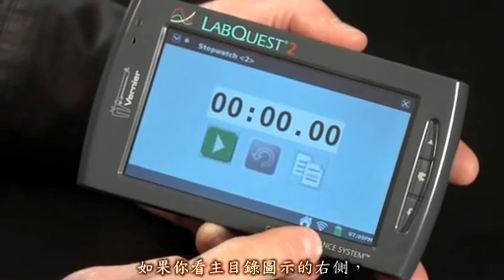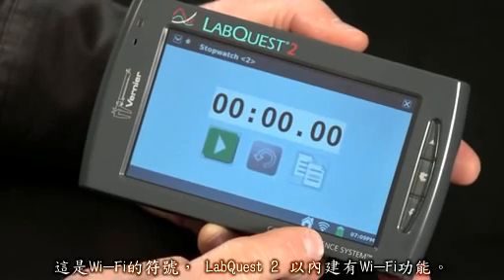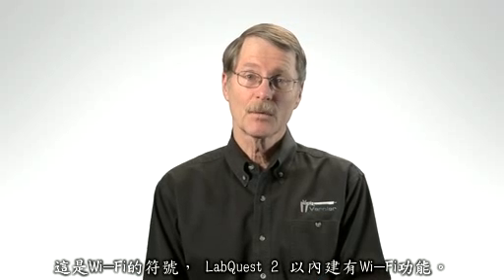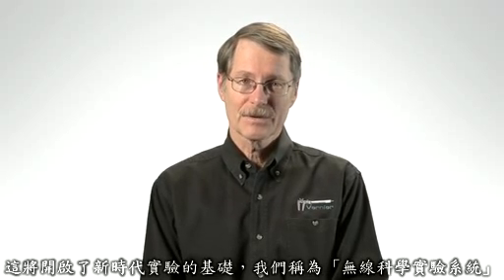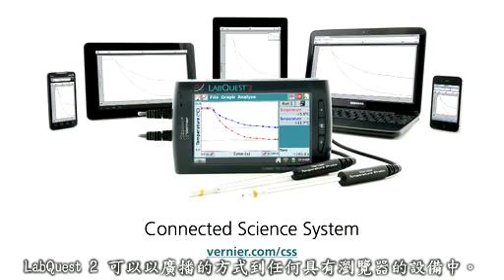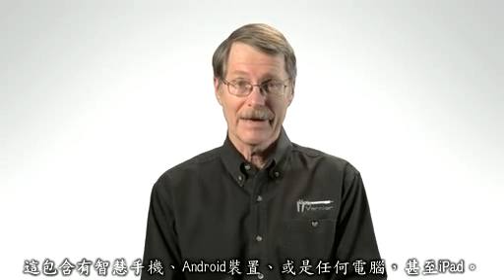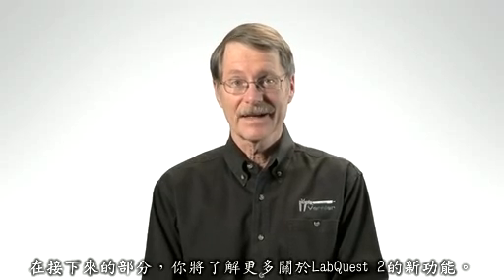If you look right next to the home icon, you'll see another interesting icon — that's a symbol for Wi-Fi. LabQuest 2 has built-in Wi-Fi, and this opens great possibilities for something we call the connected science system. A LabQuest 2 can broadcast data to any device that has a browser, including smartphones, Android devices, any other computer, or even iPads. You'll learn more about that in the next segment.